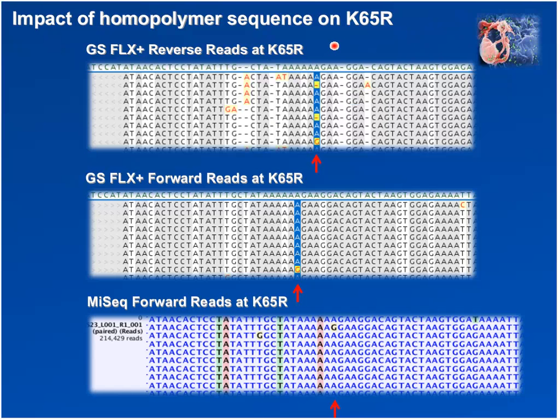Once again, this is in subtype C individuals in reverse strand reads. These numerous insertions and deletions cause the generation of an erroneous variant frequency result. In fact, these deletions typically cause an erroneous elevation in the variant frequency.